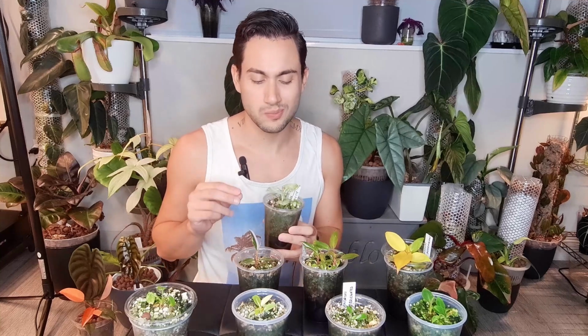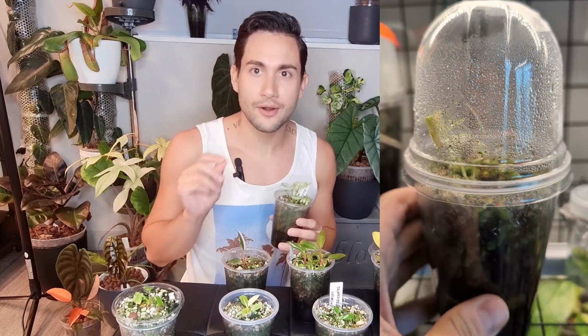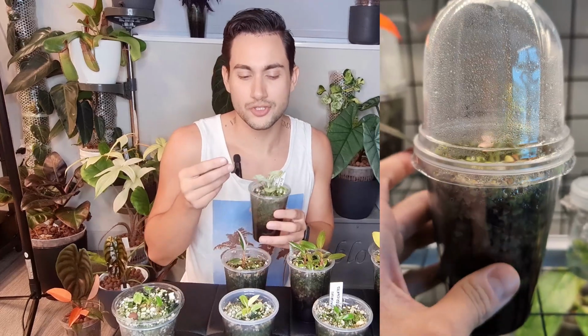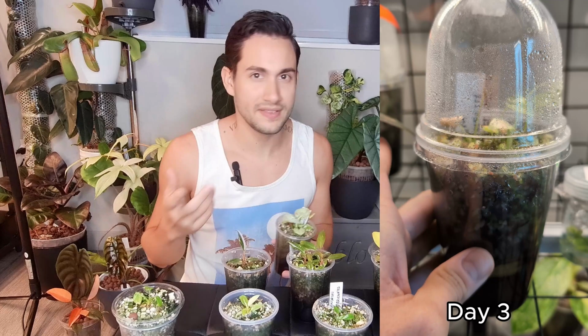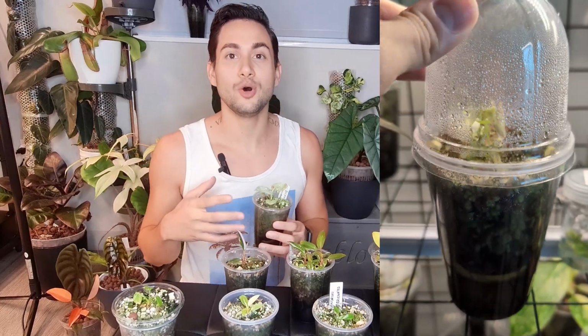This is a plant that had 5 of them. Whenever I opened it and I was cleaning it, this was probably the one that was kind of the gunkiest, along with the red Anderson. So out of all of them, I think out of the gate, I knew one of them was not going to make it. It was just looking like a bulb. So I did not think it had a lot of hope. And I was right. It died fairly quickly. And then all the other 4 kind of went with it.